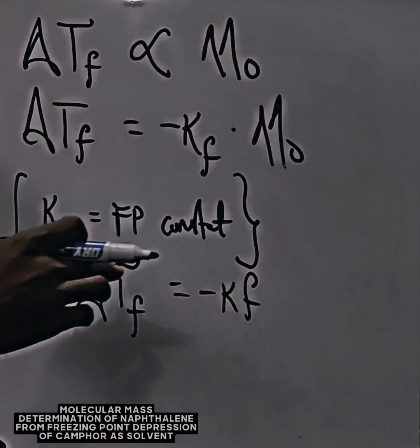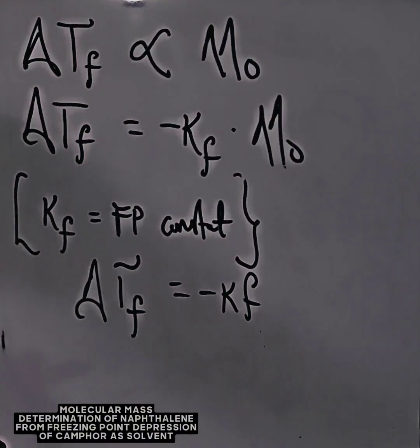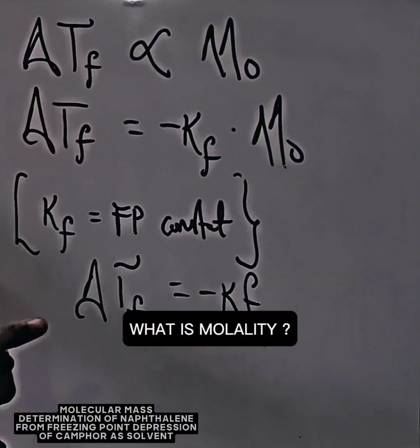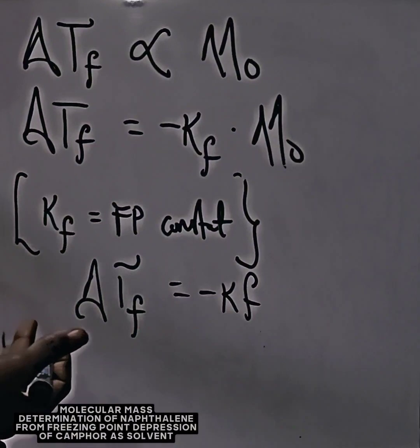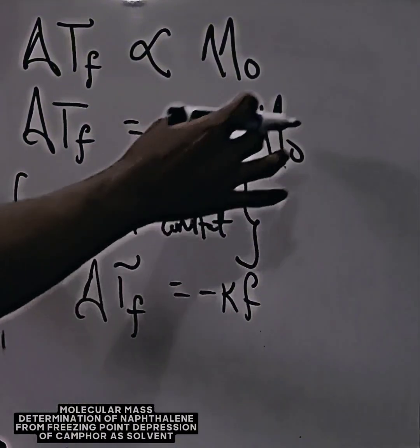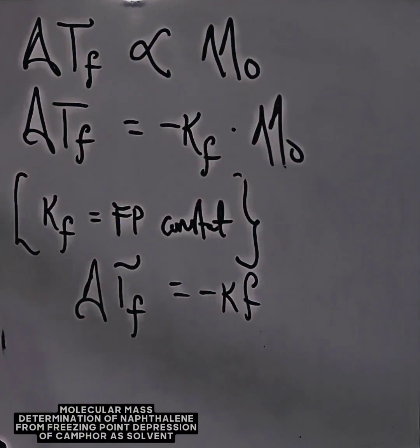Now let us define what molality is in regards to the experiment and the determination of the molecular mass of naphthalene using camphor as a solvent. How would you quantify molality?